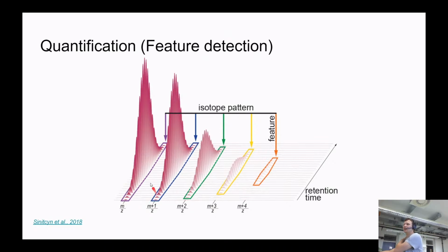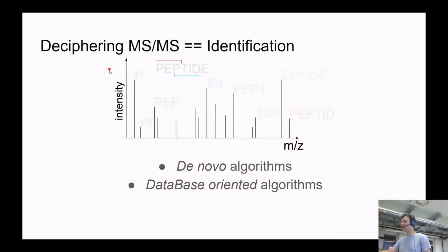We do see the peptide. And the truth is that if we measure this peptide very frequently, we see a 3D shape for each isotope. We can integrate these 3D shapes and basically measure the volume of the 3D shape. And this volume is going to be exactly an intensity measure for us. That's what quantification means, the peptide quantification feature.